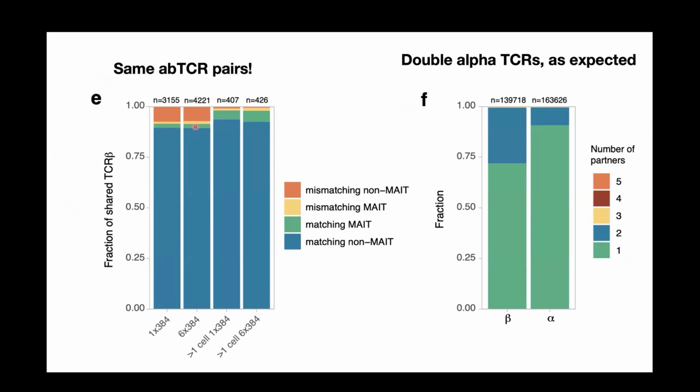You see it's around 90%. But if from 10x you exclude singletons, precision goes up, right? And basically this is a hint that maybe if you have just 1 cell in 10x, frequently it might be an incorrect pair. It might be a sequencing error, it might be an artifact. So the idea is that maybe TIRTL-seq is even more precise, and these mismatches to 10x are mostly concentrated in single cells found in 10x, and these single cells in 10x are not correct pairs. So it might be bad on the 10x side.